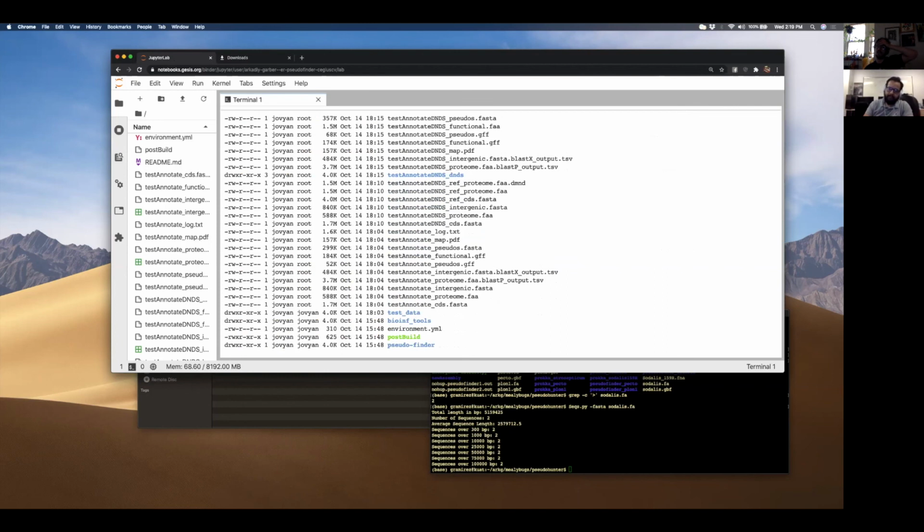but I think it's generally accepted that if you're doing DNDS analysis, you want a one genome to one genome comparison. If you provide another genome within that same file, you're going to have slightly different relatedness to that genome, so the divergence time between the genomes is going to be a little different, and that might influence the final DNDS calculations, because overall DS is going to be different.